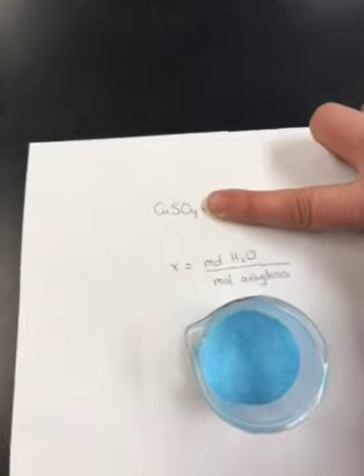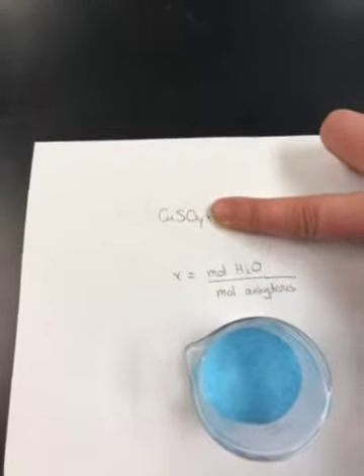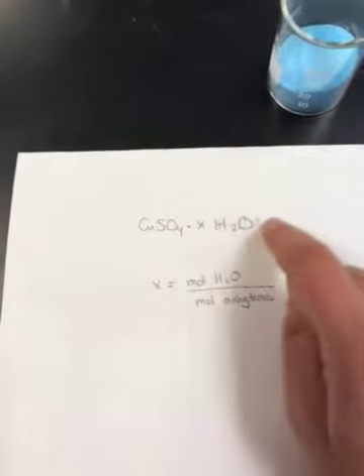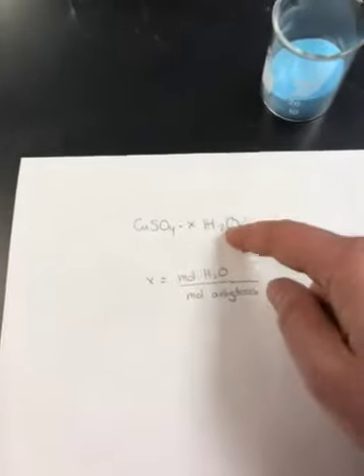So then we're going to mass that, and if we have the grams of the anhydrous, then we can change it to moles so that we can plug it here. Now to figure out the moles of the water, well, we have the mass of the whole thing with the water. We also have the mass of it without the water. So if you subtract the 2, that's going to give us the mass of the water, and we can go from mass to moles, and we take the moles of the water, divide the moles of anhydrous. So let's read the directions together.